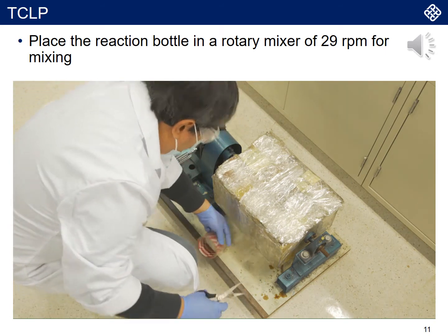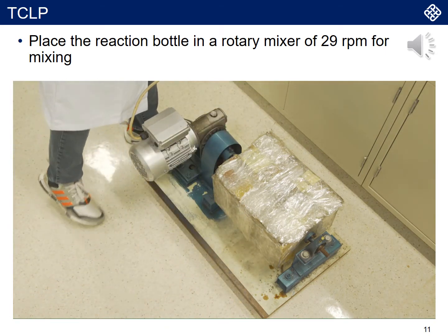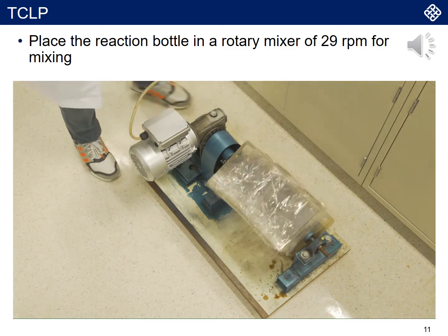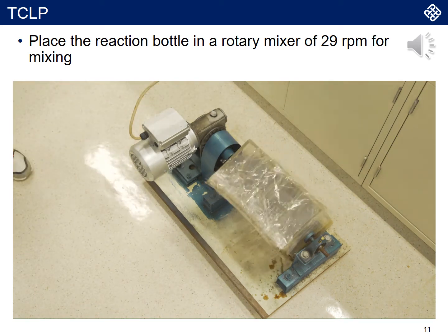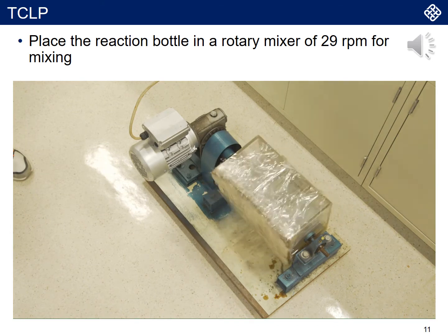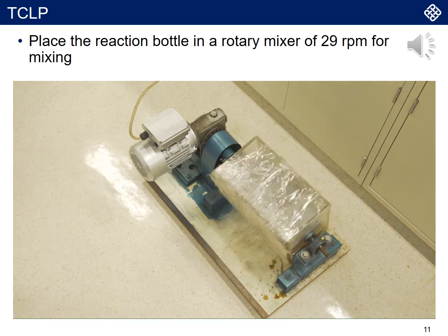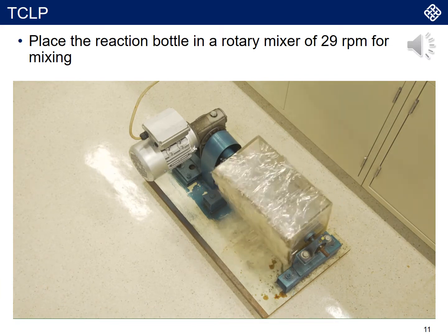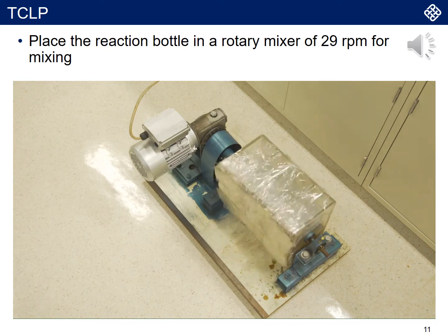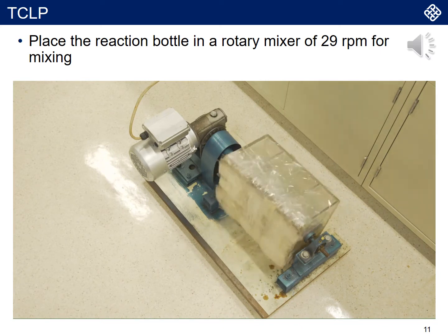So basically what you need to do is just mix the samples in the rotary mixer, and the rotation rate will be 29 rpm, and you just carry out the mixing for a certain period of time.